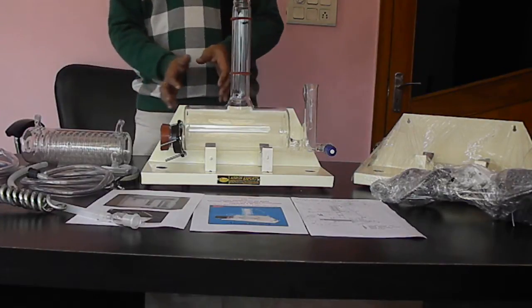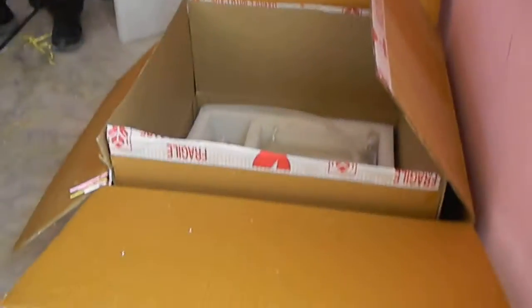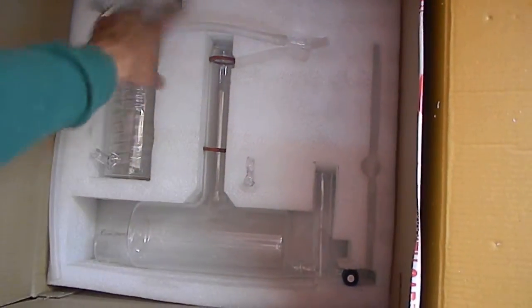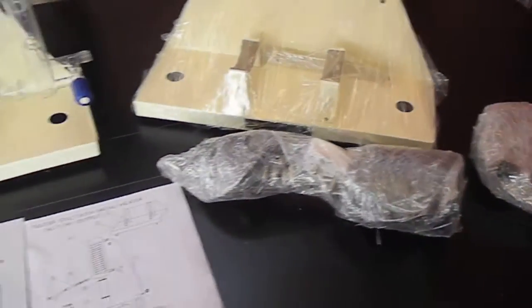What we give is all packed in one wood box which has a metal part. All the glass parts are inside, and these are all parts that we have taken out and opened.